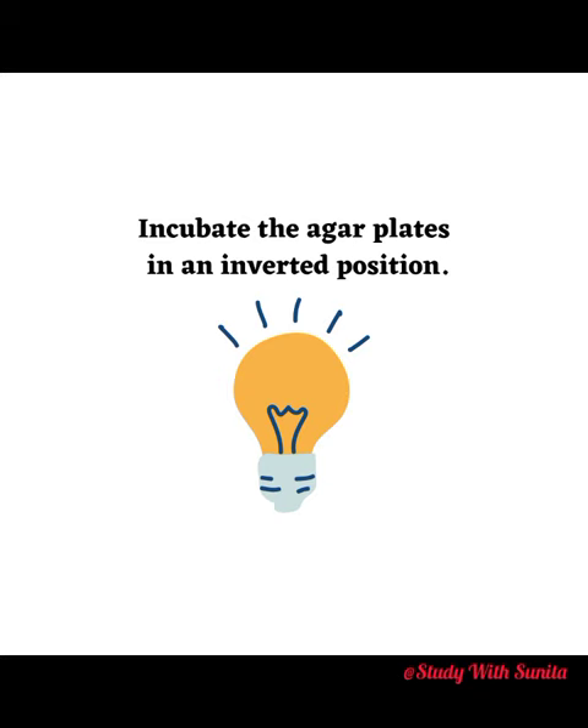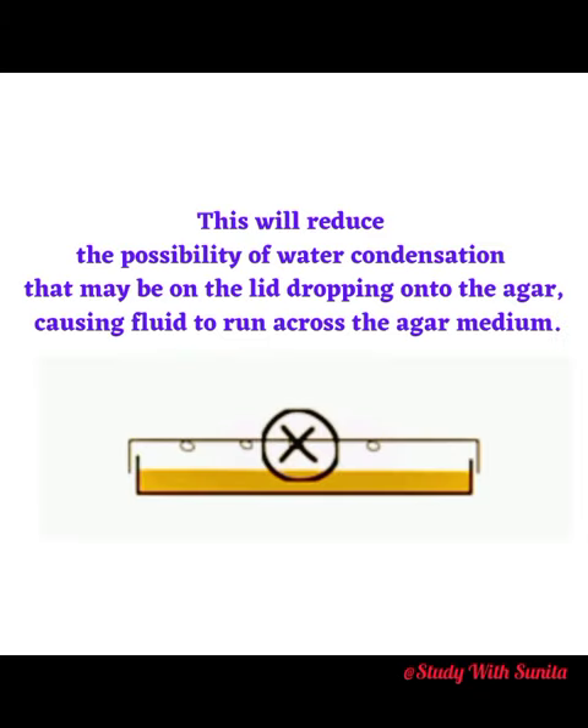Incubate the agar plates in an inverted position. This will reduce the possibility of water condensation that may be on the lid dropping onto the agar, causing fluid to run across the agar medium.